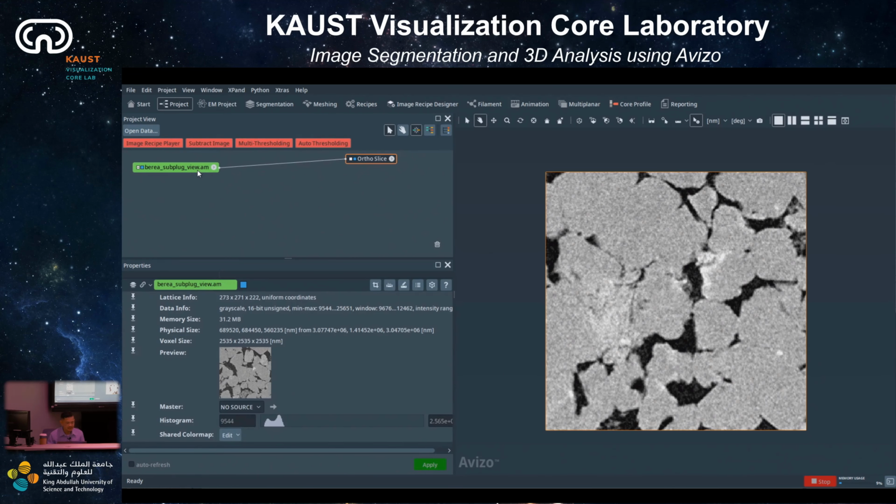Okay. If you right click, you will see the drop down menu. On the drop down menu, on the left we have two sections. The top section is like favorite, recent, and some different folders, but consider the lower section of folders. You can look in any folder.